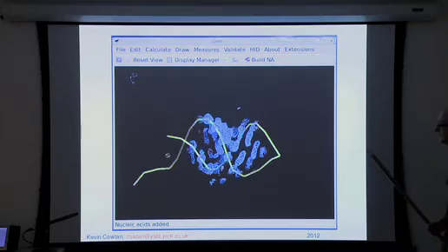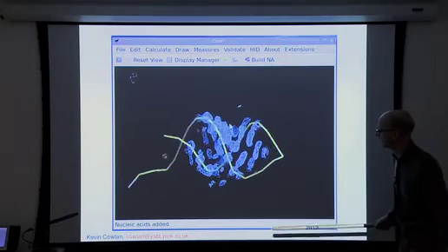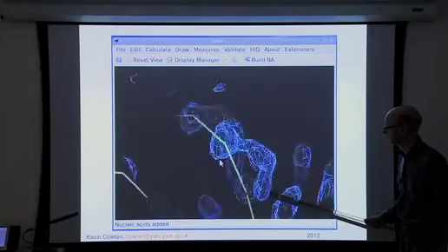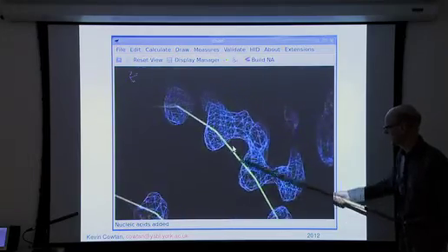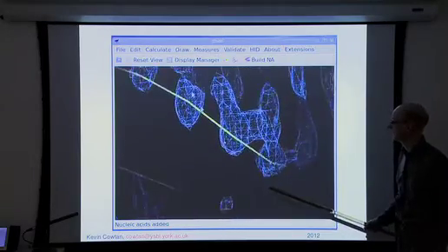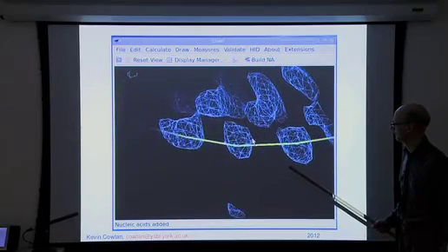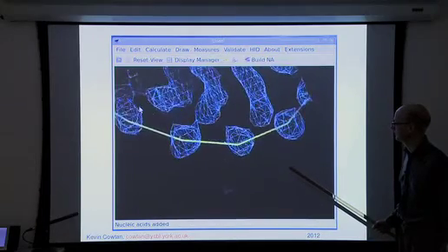And we can have a look at the density here. And you can see that actually it's pretty broken. If this were protein, you couldn't build it so easily. Here it's a bit clearer, but there's still gaps in it. But it's clearly right at this point.